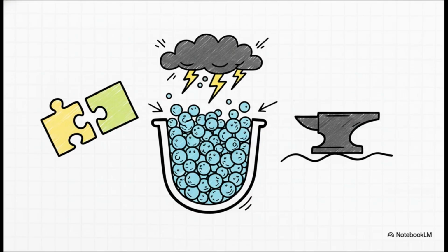So, why do these standard curves fail at the top end in the first place? Well, it's usually a structural issue with the assay itself. Most commonly, the required analyte range simply exceeds what the assay architecture can naturally support. Development teams often mistakenly and optimistically extend standard curves without rechecking the true binding behavior. Other times, one-step kinetics favor non-productive binding, meaning the analyte binds the detector in solution before ever hitting the solid phase. Or you might just have mismatched capture and detector concentrations. Your incubation and wash conditions could literally be ripping apart your equilibrium. Or maybe an upstream binding problem is just being compressed by your signal system so you can't properly see it.